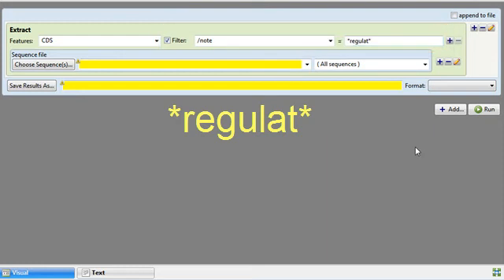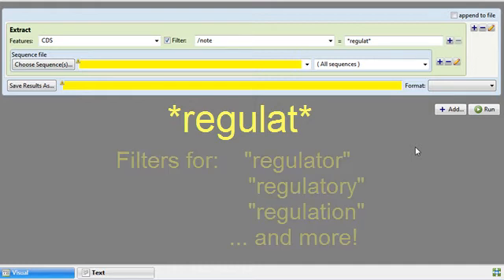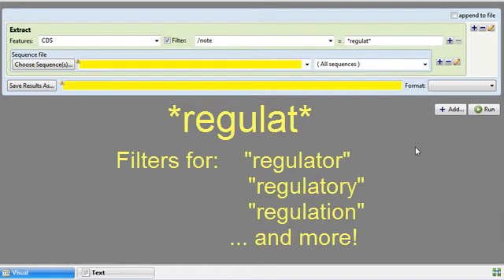The asterisks that I typed on either side of REGULAT are wild cards that will cause SeqNinja to search for any note that has REGULAT anywhere in it. SeqNinja will thus find notes containing the words REGULATOR, REGULATORY, and REGULATION.